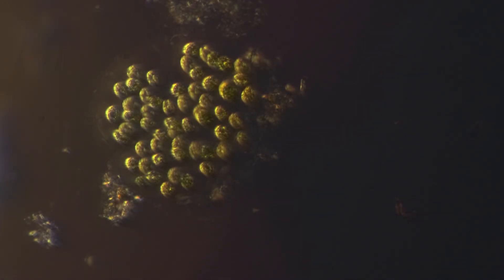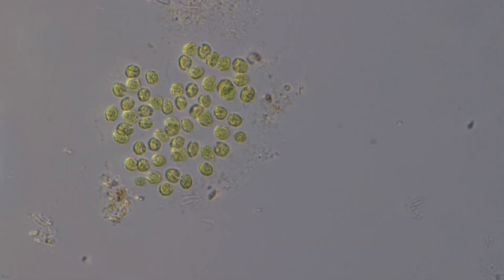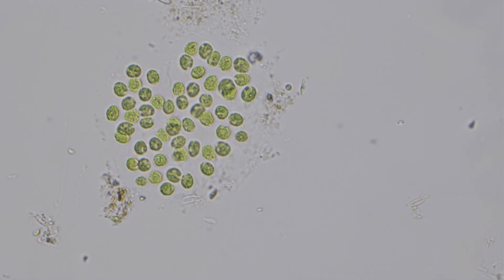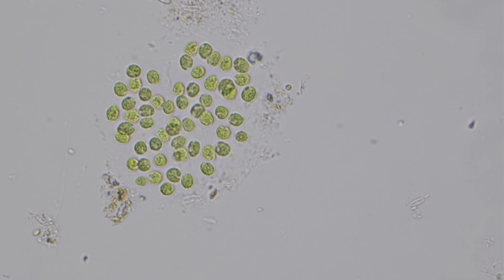Illuminated from the side, in a semi-dark field, it appears like green-gold jewels or insect eggs. But placing a light source directly beneath reveals a translucent nature, a life form filled with food-producing chlorophyll, and an essential food base of the ecosystem.